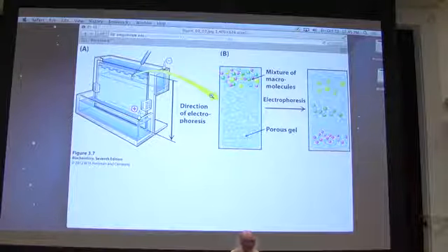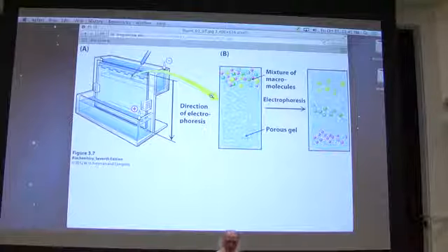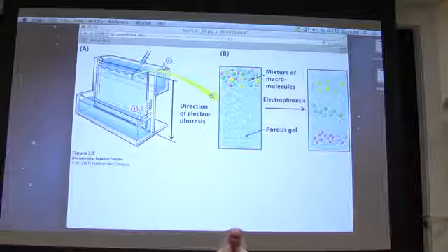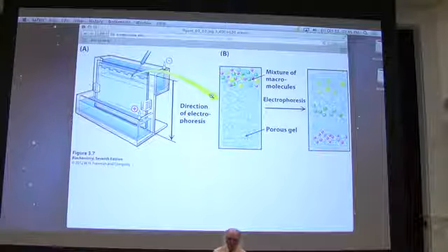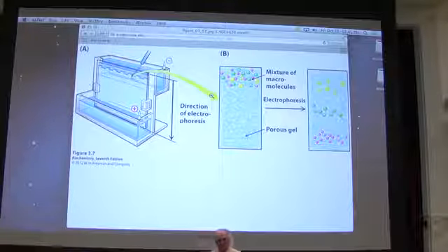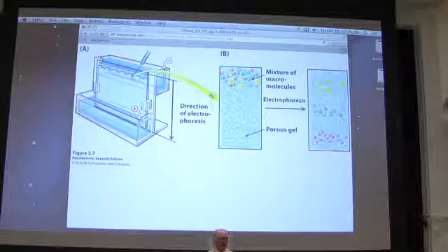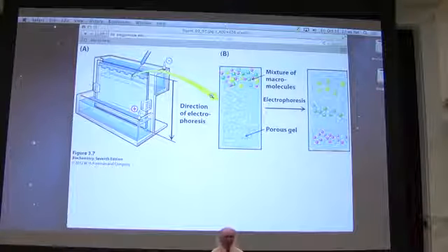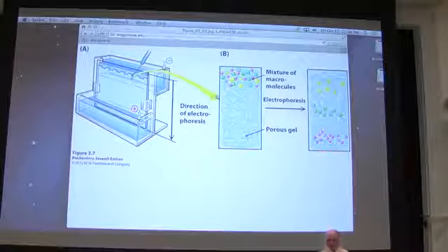Say it again. For every 2 amino acids, you need 1 SDS. And so that coating is happening on a regular, repeating basis. That's correct. So since it's not necessarily the length, but the primary structure that determines the protein, if you have one similar length, how far apart can it be really? Okay, her question is, basically, if you have 2 proteins of similar length, how good is this process at separating those? The answer is pretty darn good. You can separate things with a fairly small distinction in molecular weight. Okay? Yes?